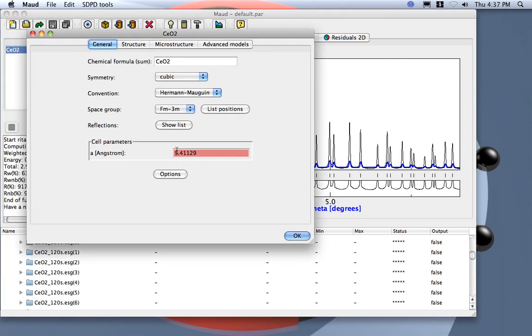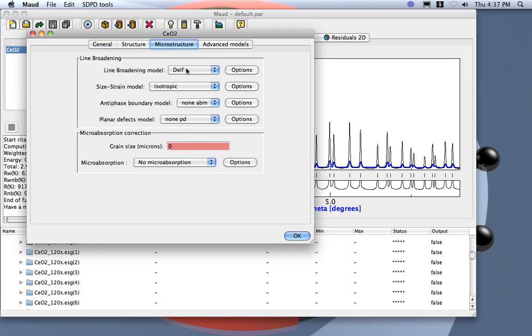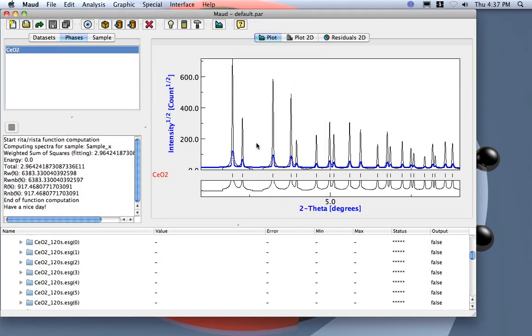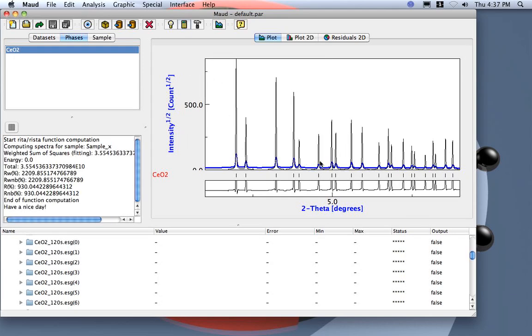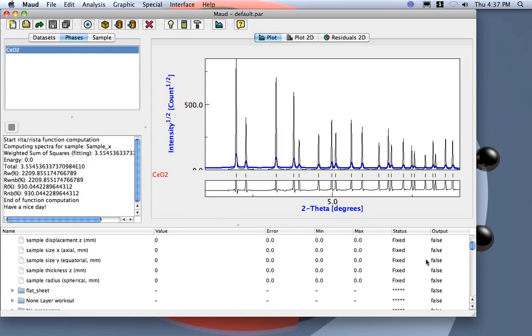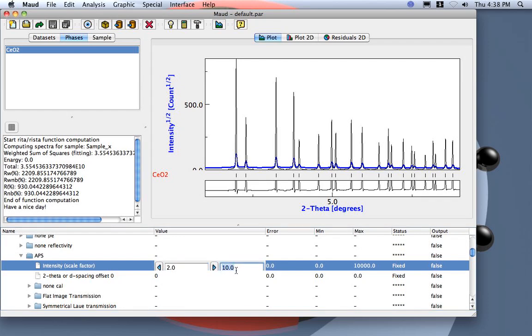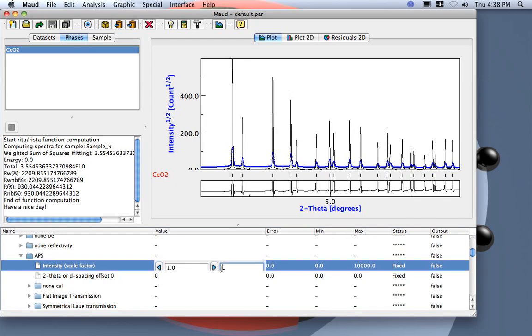Now we would like to calibrate our instrument and compute the instrumental broadening. We keep the cell parameter and wavelength fixed and refine only the sample-detector distance and the image tilting — this is for detector calibration. For the instrumental broadening, we assume this cerium oxide has no sample broadening, so the line broadening model is set to none. This way we will not use any sample broadening. I can also lower the intensity a bit to check everything looks okay.